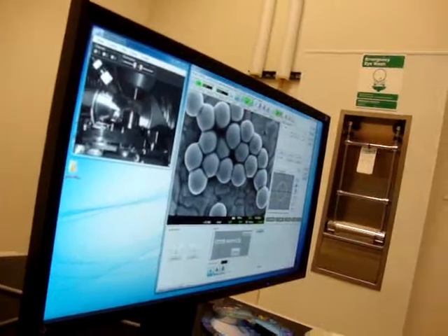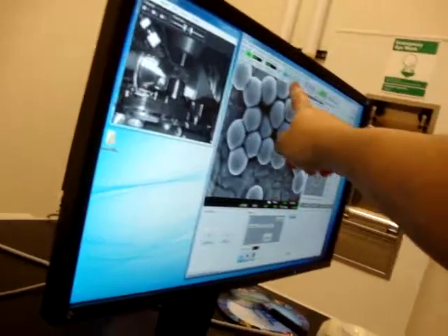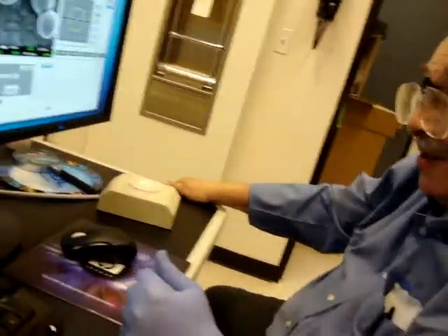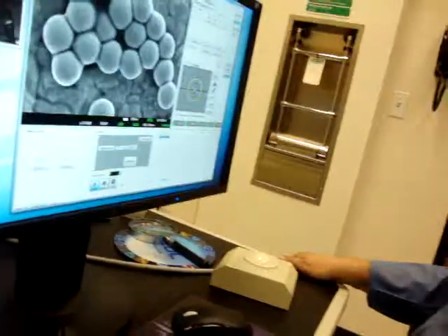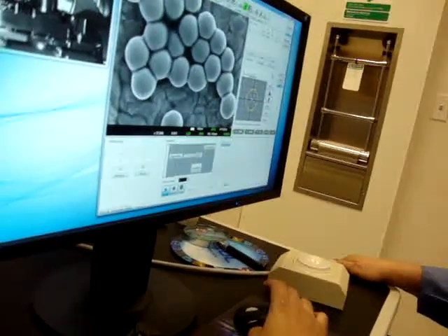What is CF? CF. You just pressed CF next to... Oh, yeah, that's coarse focus or something. Okay. Let's see. All right.